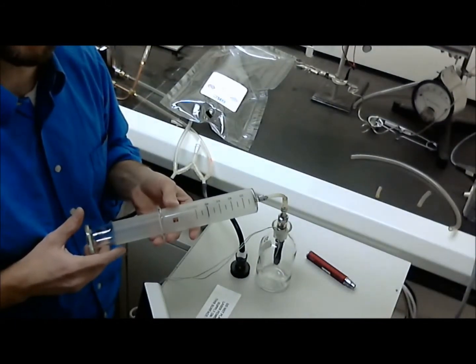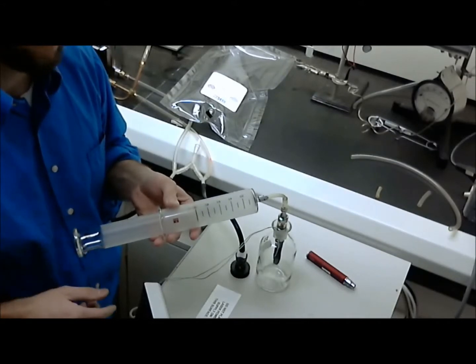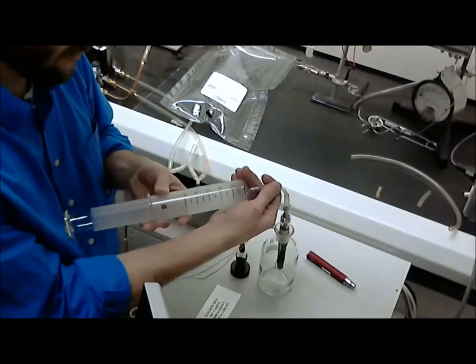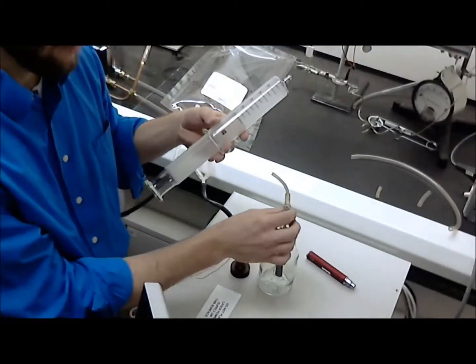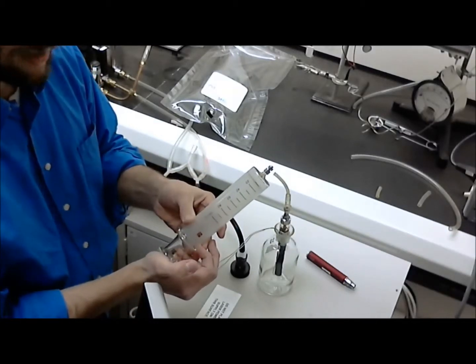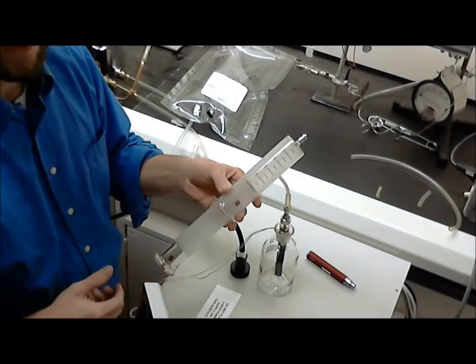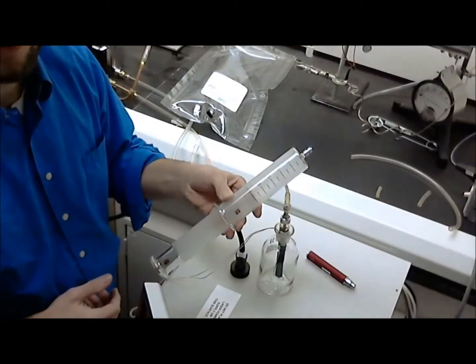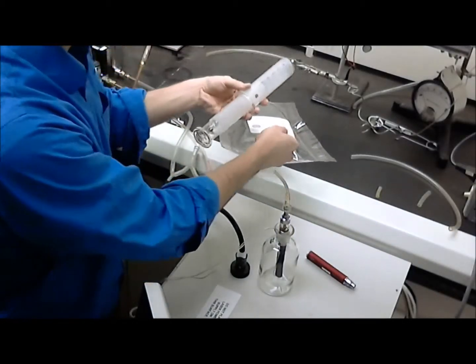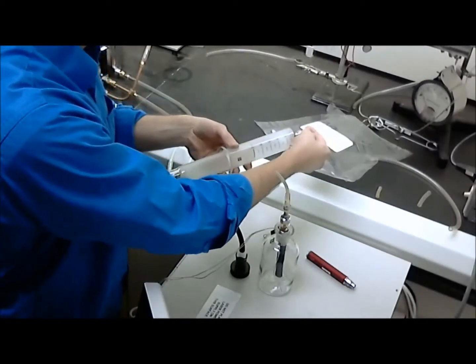After the e-cigarette was turned off, an additional 20 mils was puffed through the device to clear any residual aerosol. This was detached from the e-cigarette and expelled to the 10 mil mark, then refilled to 100 cc's with laboratory air. This was then injected into the gas sampling bag that was pre-filled with 2.9 liters.